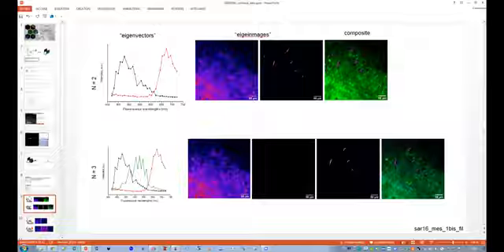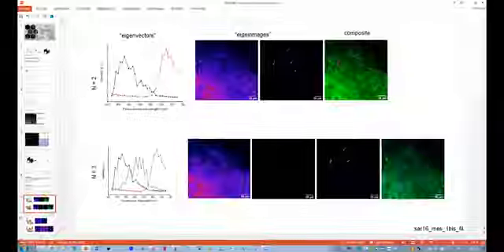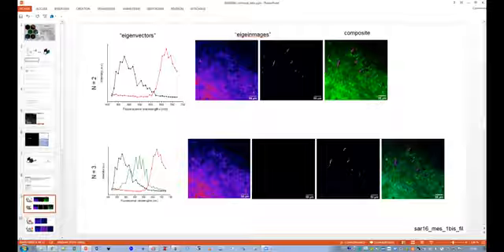Yeah, I remember that we tried to do something with the remaining pixel, the square of the remaining pixel, and to see if it was diminishing with the increase of the spaces.